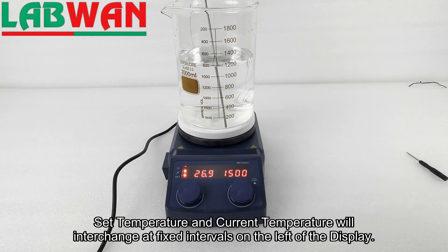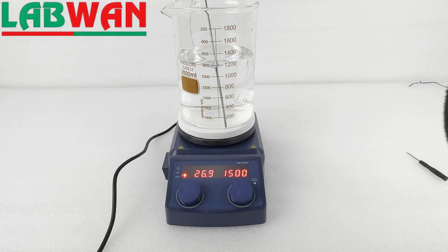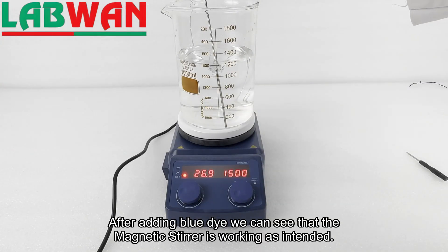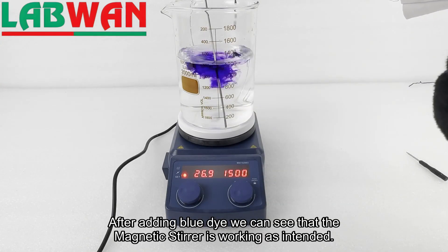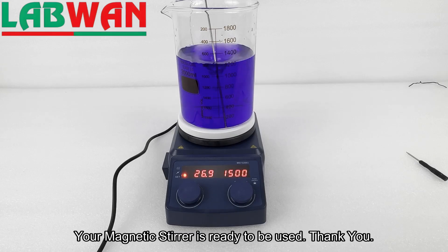Set temperature and current temperature will interchange at fixed intervals on the left of the display. After adding blue dye we can see that the magnetic stirrer is working as intended. Your magnetic stirrer is ready to be used.